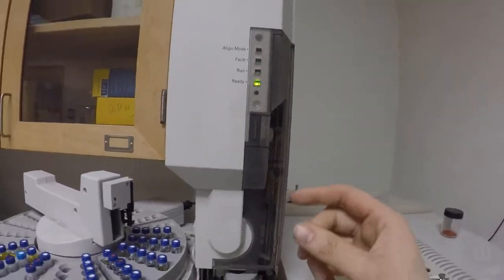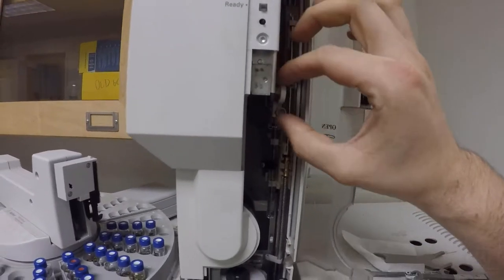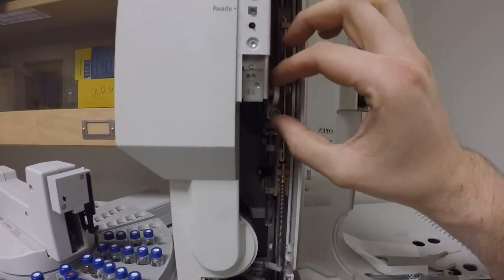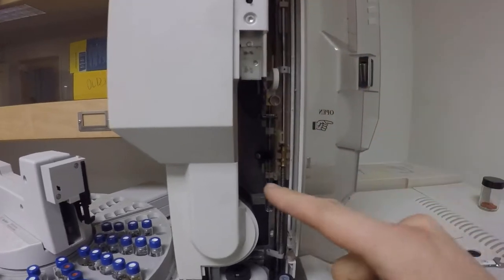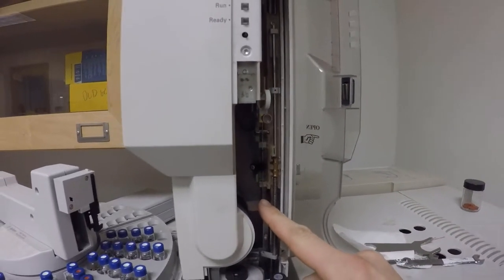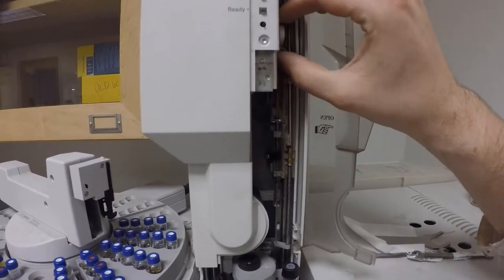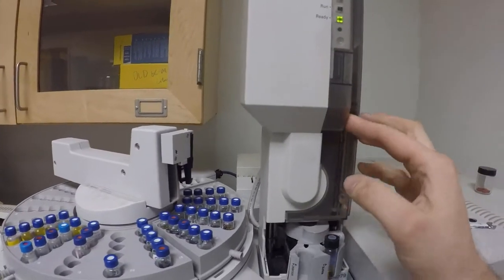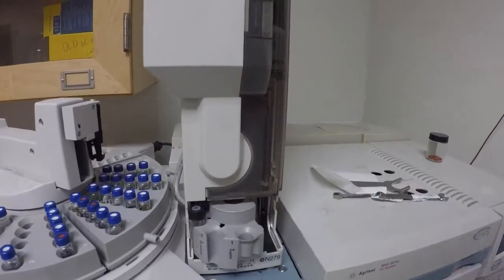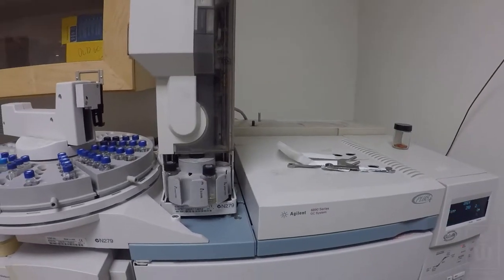Okay. I also like to check one thing. I'll open this syringe port and make sure that this little knob can move up and down freely. If it can't move up and down freely, that means that we have a jam in the syringe and we'll need to do some cleaning of it before we actually do our experiment. So I make sure this thing goes all the way up and down without any work at all. Then I'll close this. And it's going to do a little spin and get itself figured out.